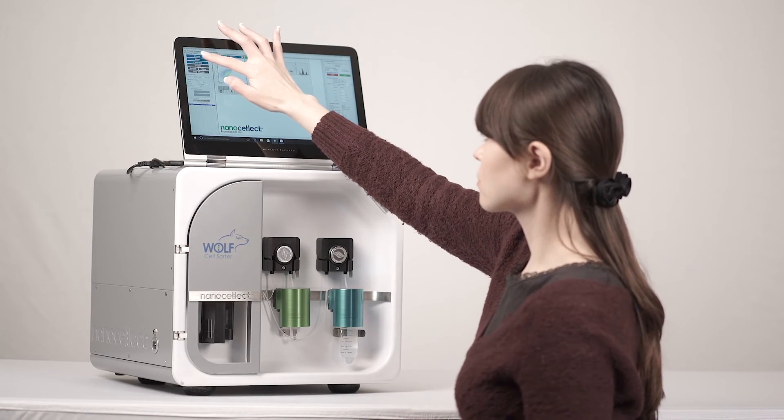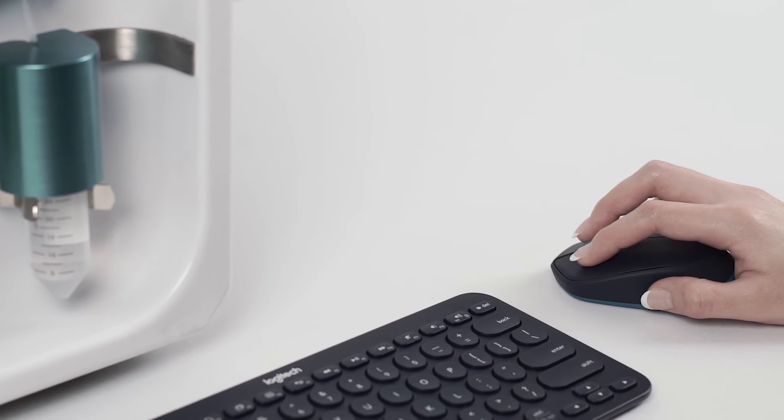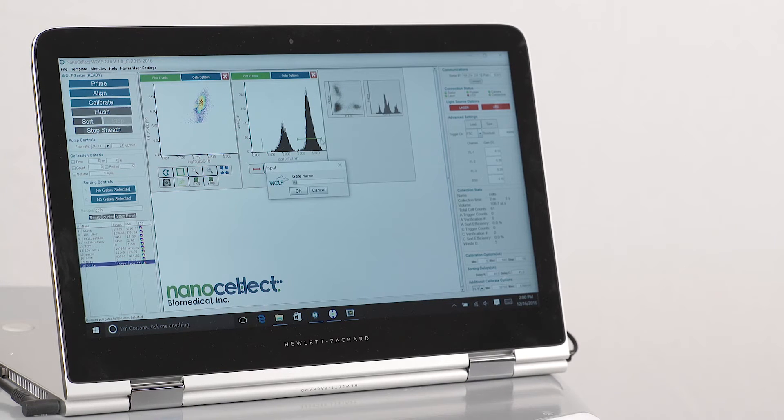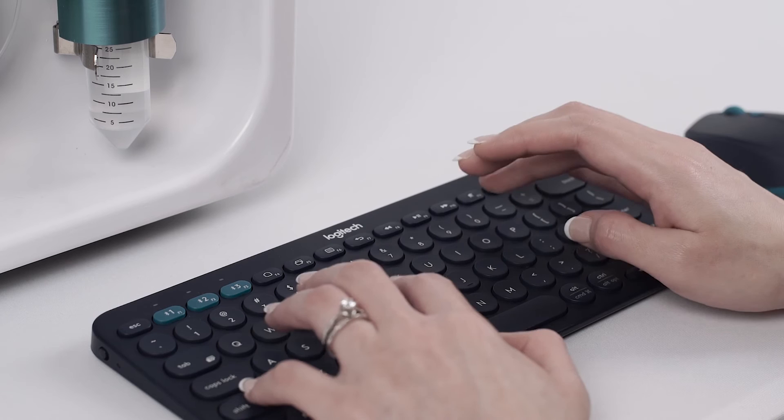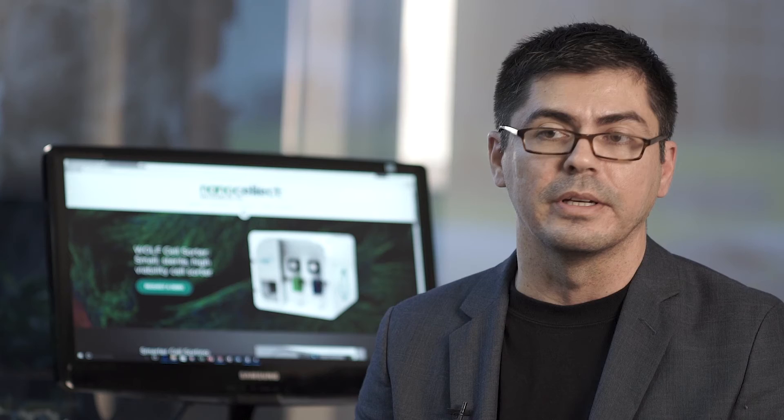During the priming step, you can initiate your alignment. Once alignment is complete, you set your gates and pick your positive cells that you want to sort. You can then press sort and begin sorting and you're done.